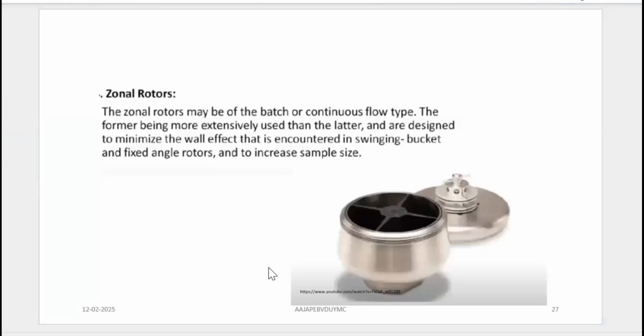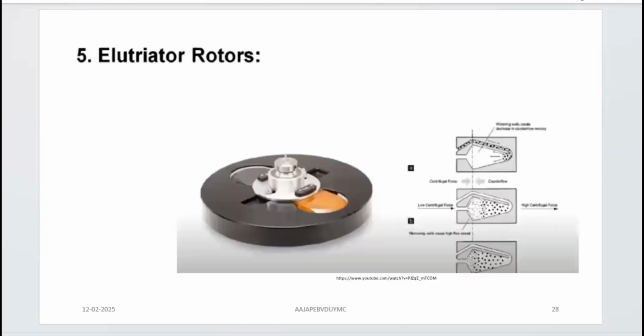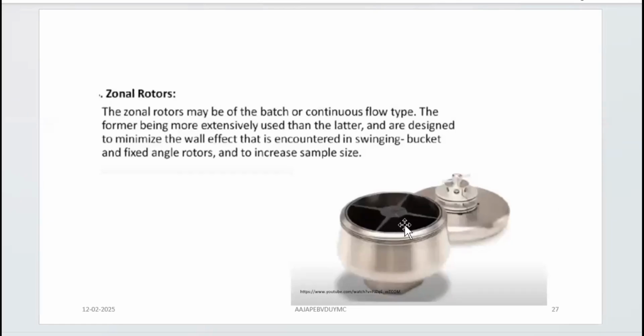The design is such that each rotor is like a large cylinder, and the interior of it is divided into hollow bowls. Each bowl is going to act as a centrifuge cell, and you can observe the actual centrifugation process that is running. Right now, let's look at how it is going to be. You are seeing the particles that are getting separated. These are the four quadrants. Just see these margins, the separating walls. Parallel to these separating walls is the sample inlet, or the sample is overlaid on the surface of the chamber or the cell at the entry point.